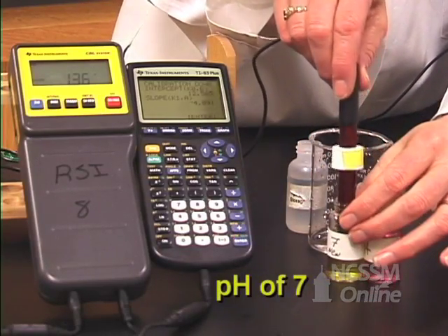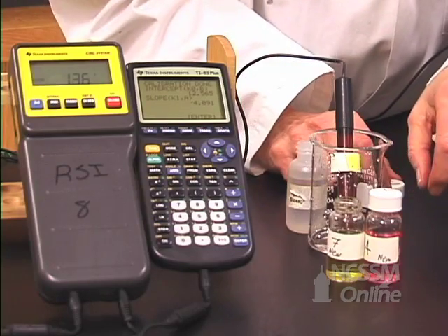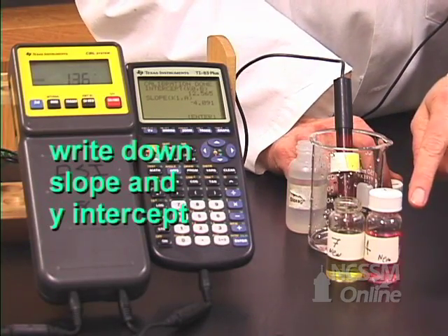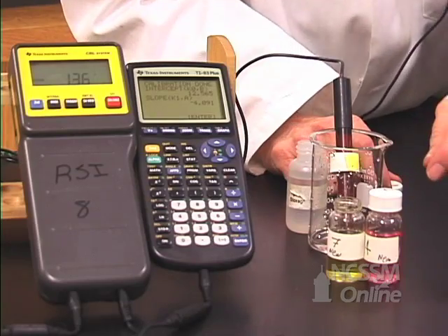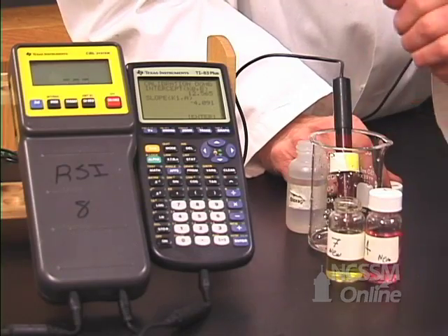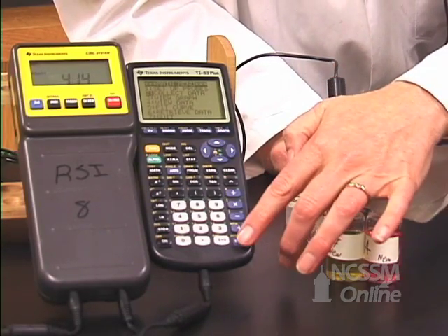On the screen you'll see slope and y-intercept. Write these down in your notebook, because if something happens during your experiment you won't have to perform the calibration all over again — you can just input the slope and intercept into your calculator. Now that we're calibrated, press enter and it will return us to the menu, and we can begin to collect data.